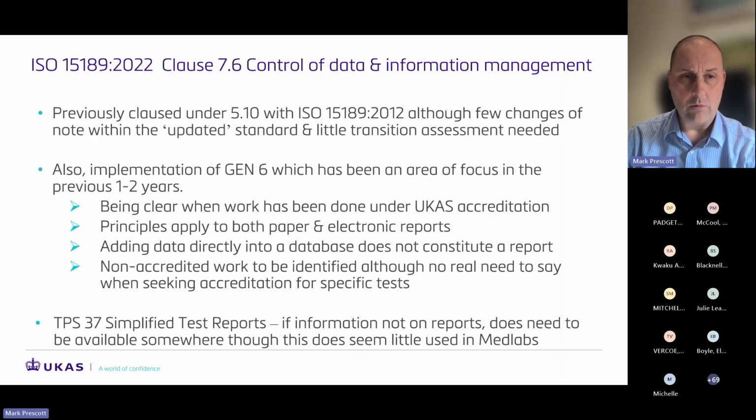It's really all about accredited work and non-accredited work being identified on reports. That's the key area with this. We are certainly now starting to see more networks. I'll touch on this a little bit later. So we're seeing more results being accumulated into a single report, which can make this a little bit more complicated when there are some non-accredited tests on there.